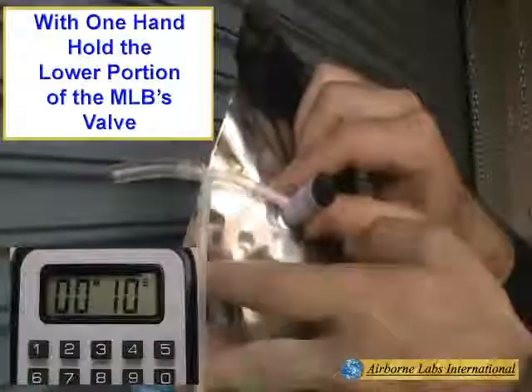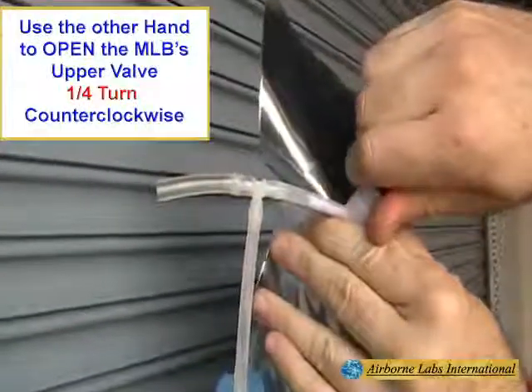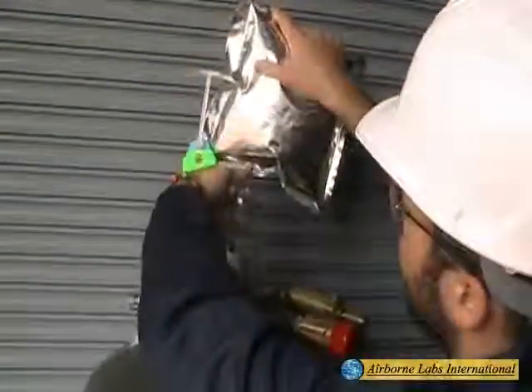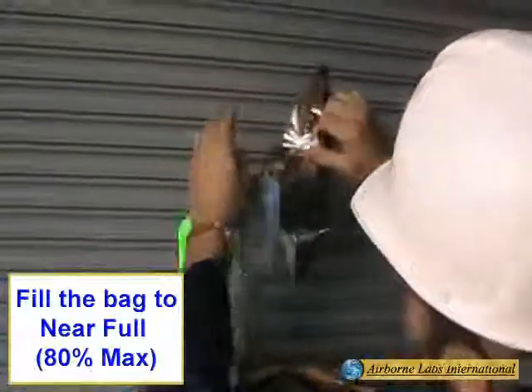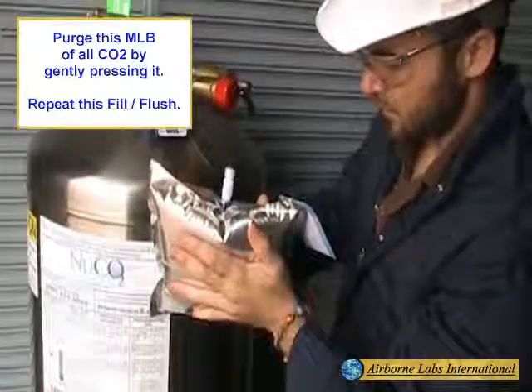Next, with one hand holding the lower portion of the MLB's valve, use the other hand to open the MLB's upper valve head by turning the knob about a quarter turn counterclockwise. Fill the bag to near full, approximately 80% max, then disconnect the bag from the T-Fitting.